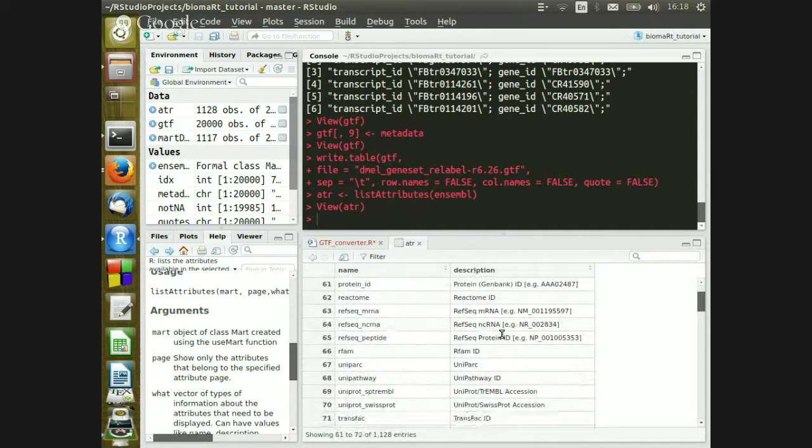Ooh, the SRA is pretty good. Can you pull down all the descriptions of what things are? That's awesome. It's a maze, with these weird projects. If you know that, that's awesome. I'm going to have to check that one out.